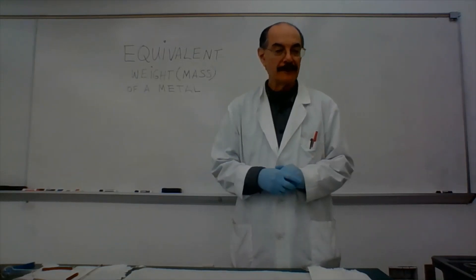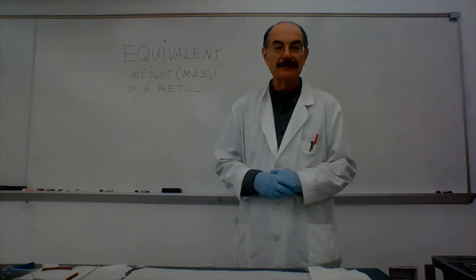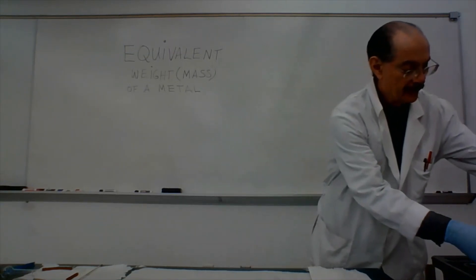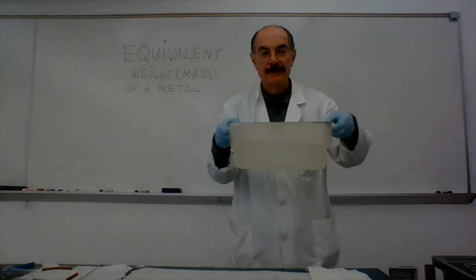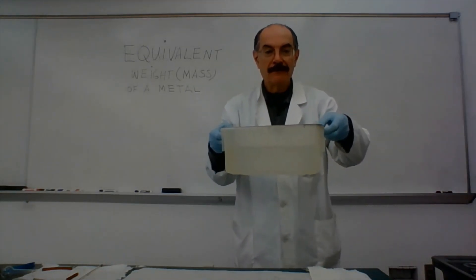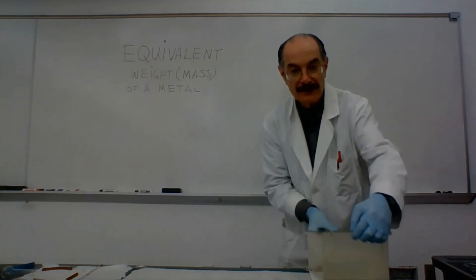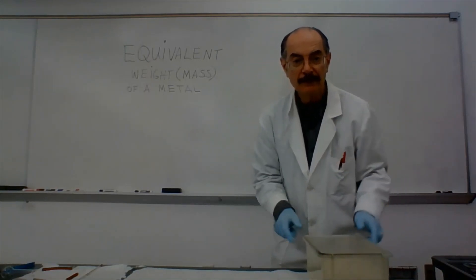If you were doing the experiment, you would be receiving several items from the stock room. One of them is a big tray here that you're going to fill with water, probably like two-thirds of the way up. I'm going to put this down here.